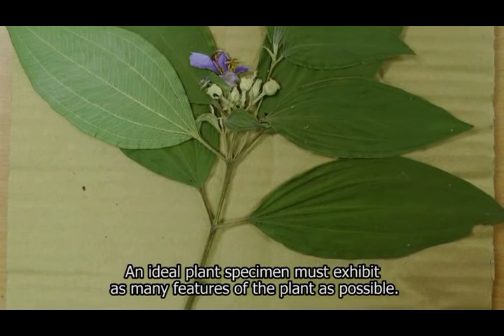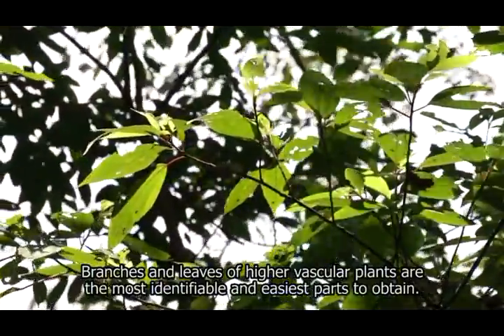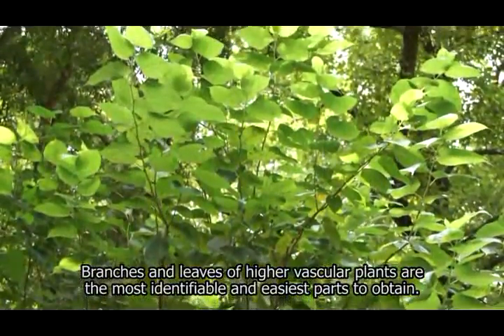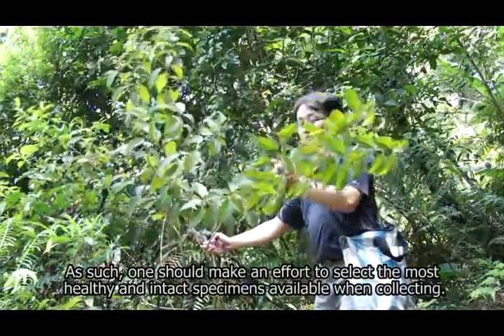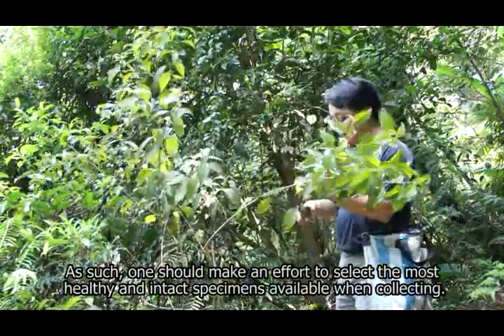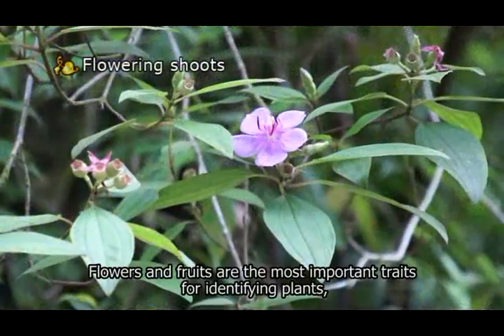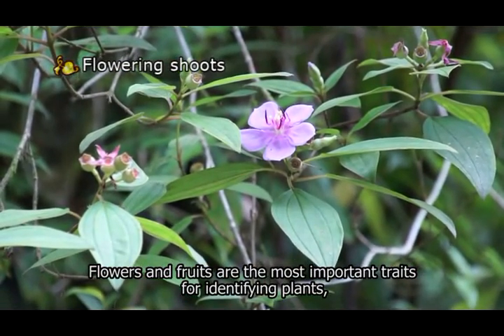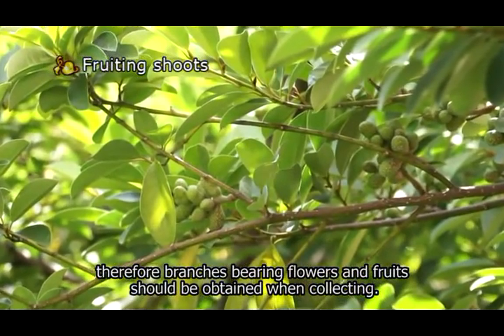An ideal plant specimen must exhibit as many features of the plant as possible. Branches and leaves of higher vascular plants are the most identifiable and easiest parts to obtain. As such, one should make an effort to select the most healthy and intact specimens available when collecting. Flowers and fruits are the most important traits for identifying plants; therefore, branches bearing flowers and fruits should be obtained when collecting.